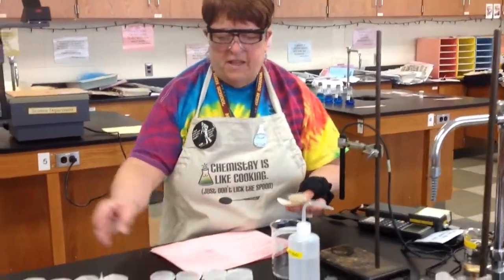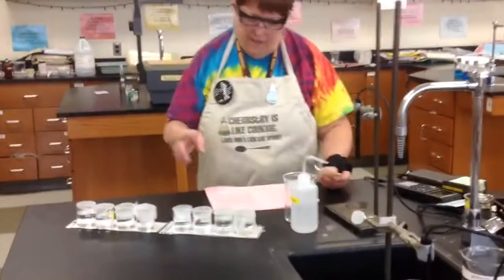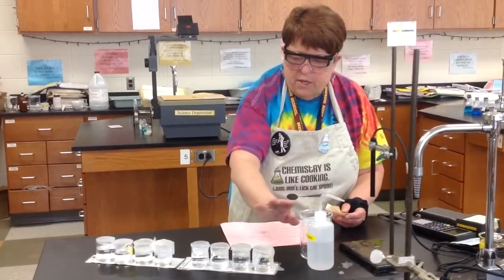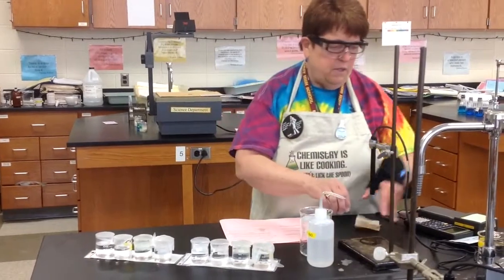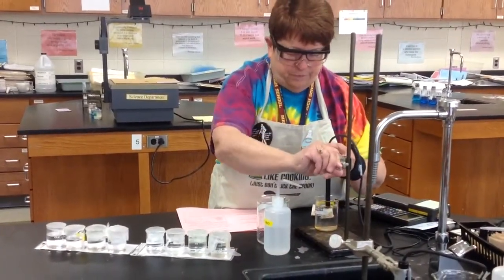Okay, and then go down the line and record the measurements. It says in step 5 to dry out the distilled water and so on. You can just leave all the beakers as they are, but when you're done, the probe needs to go back in the storage solution.